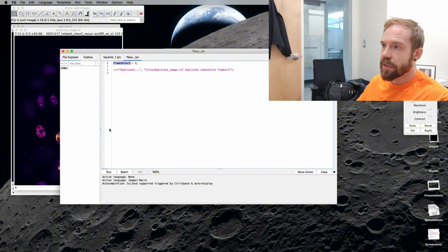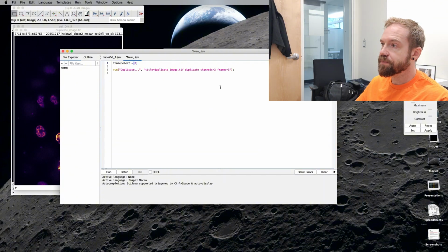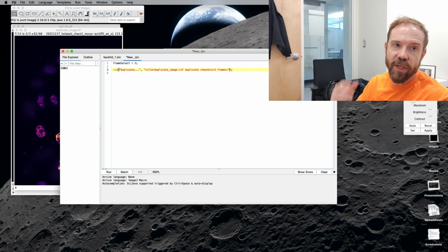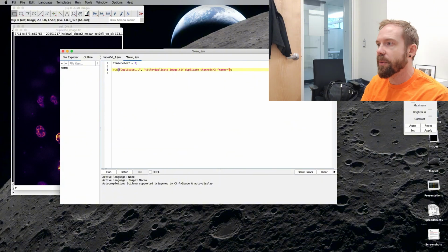We've made a variable. It contains a number. So every time we call this, it's going to bring up the number 3. Now we replace the 3 in this. And so what we can do now is a process called string concatenation. Concatenation is really just a fancy word for sticking 2 things end to end. It tends to get used in mathematics and in programming.